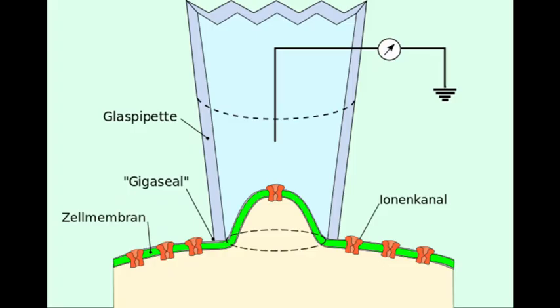A more recent method called patch clamp allows you to isolate currents from individual ion channels by isolating a patch of membrane and performing voltage clamp. Collectively, these unitary microscopic currents contribute to the neuron-wide macroscopic currents that ultimately govern neuronal activity.